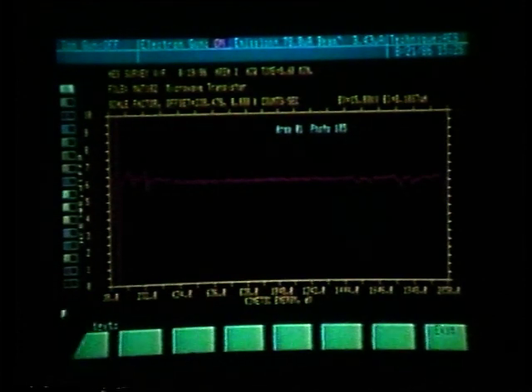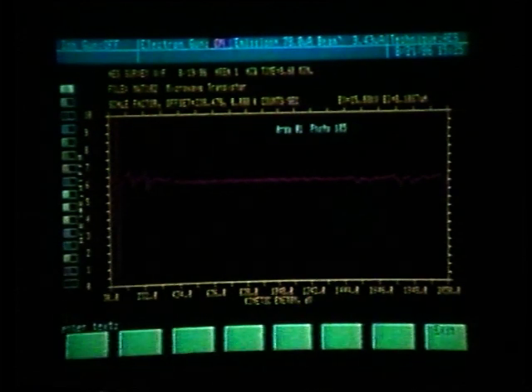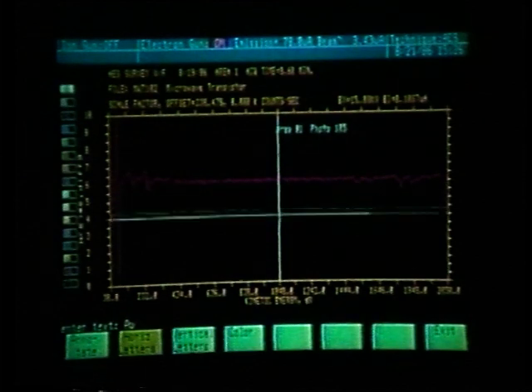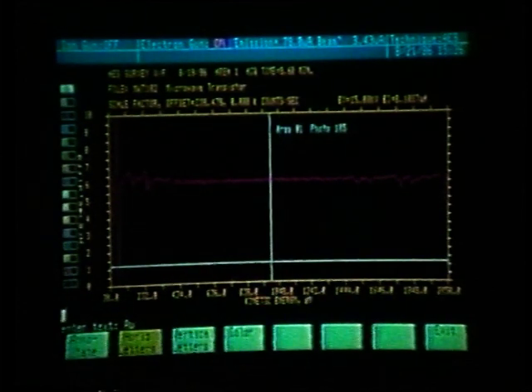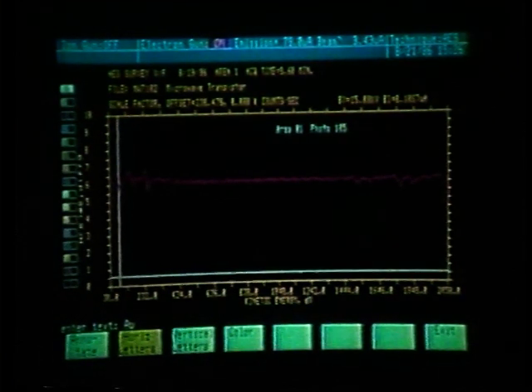What I would also like to do is identify the peaks as gold. So I will enter the text AU, enter, and then move the bars near the gold peak and annotate with soft key number 1.